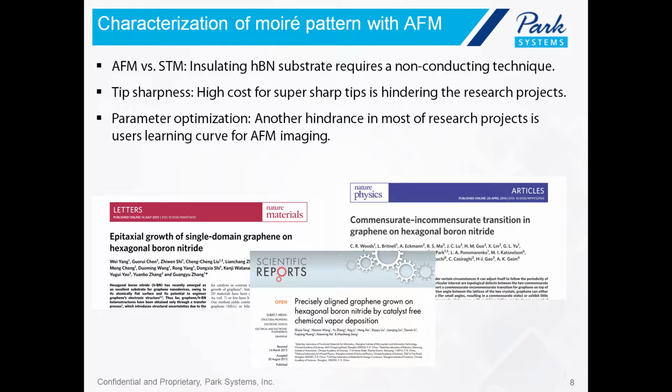Parameter optimization was the third factor that led us to characterizing this with AFM. I briefly spoke about this a little bit earlier, in that AFM has traditionally been a technique that is very dependent on the skill set of the operator. There is a notion that AFM requires a specialized trainee in order to acquire really good images that are required for publishing in different journals.